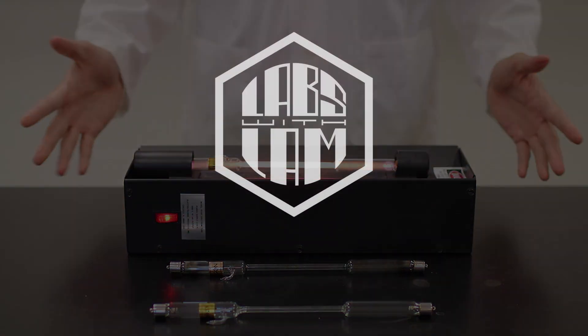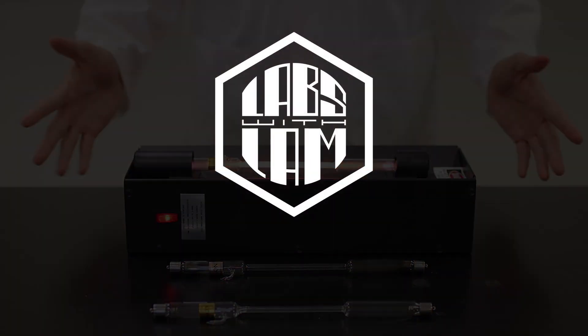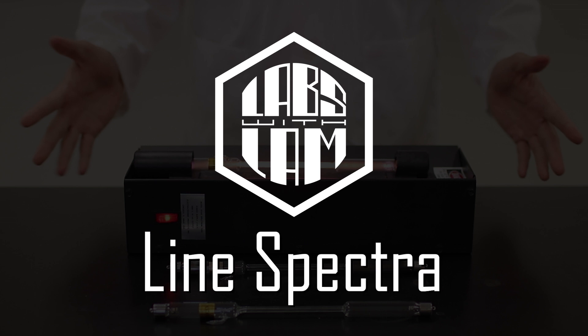What's up everyone and welcome to Labs with Lam. Today we're going to be taking a look at the line spectra of various elements. As always, make sure you've completed your pre-lab work and taken a look through the procedure before watching this video. But if you're all good to go, then let's get our observation tables and let's do this thing.